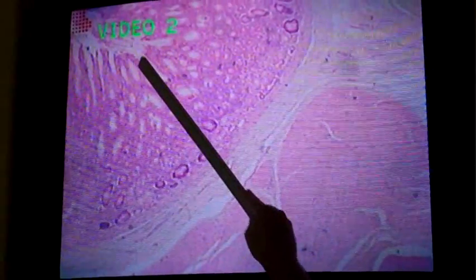Shape and location. I mean, you probably would not see a slide this magnified asking you questions about it. You're going to see one further out to start asking about layers. You're going to be somewhere out at this layer, and you're going to have questions asked off of something like this, where the very inside will be your mucosa and your submucosa, muscularis externa, and then the serous layer on the outside. I thought it would help you to see what composes those layers. But if it is magnified, it's going to be the rugae, the goblet cells, and things like that on the inside.